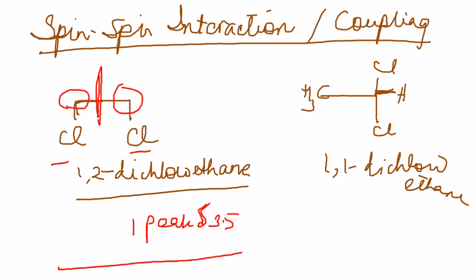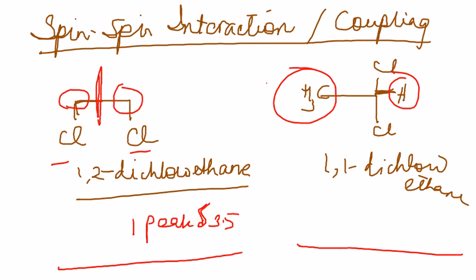On the other hand, if you think about the spectra for the case of 1,1, you should see 2 environments, one which is going to be more upfield, the other which is going to be more downfield, because it's very close to 2 chlorines now. Turns out that your spectra is not just simplified, that you have 1 peak at 1 and another peak at, let's say, 6.